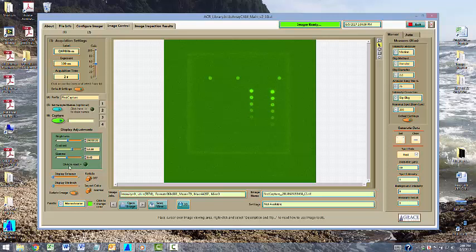If you wish to return to the original image without adjustment, simply press the Reset button. Adjustments only affect how the image is viewed on the screen and do not alter the original image.